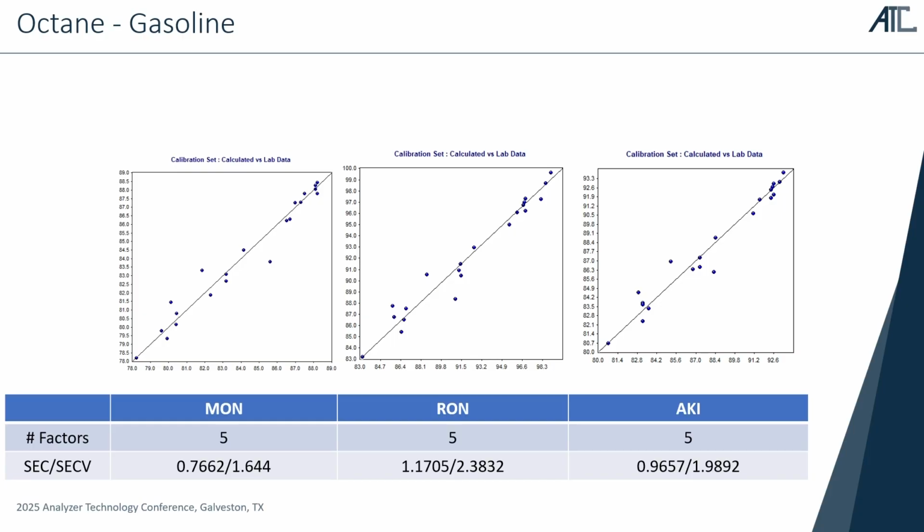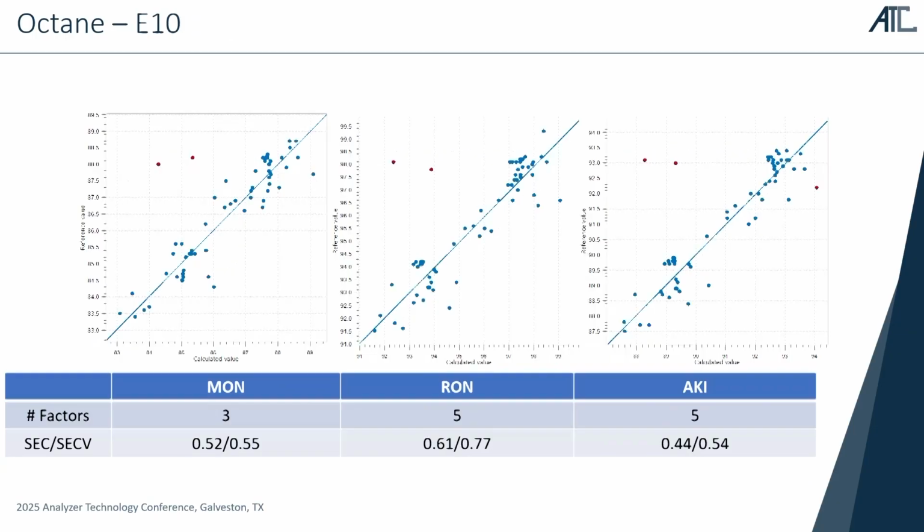And then those models can be applied on this data. You remember when I overlaid spectra and there's a lot of variation, that needs to be captured to make it then robust. And then we look more into prediction errors, calibration errors, and if they are small, then we know it is a model that predicts well. It is not that we have to have the perfectly aligned data points on a line.